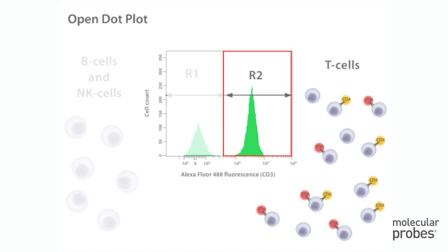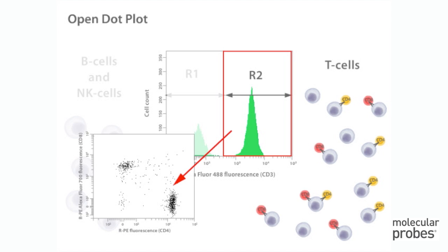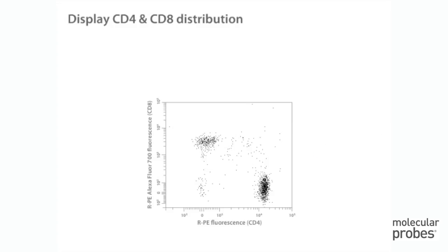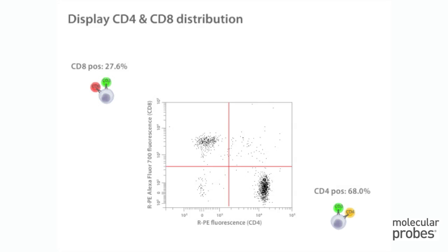To look at CD4 and CD8 cell surface antigens within the T cell population, we create a dot plot gated on the CD3 positive cells in the R2 region from the CD3 histogram. This log scale dot plot shows two parameters at once and displays the relationship between the populations expressing CD4 and CD8. In the CD4 versus CD8 dot plot, you can see four distinct populations. CD8 positive CD4 negative cells represent 27.6 percent of the T cell population. CD4 positive CD8 negative cells represent 68 percent. The CD4 CD8 dual negatives and dual positives each represent about two percent of the T cell population.